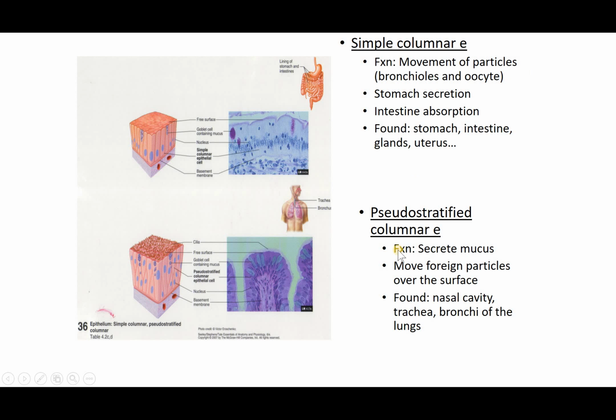Okay, and this next one, pseudostratified columnar epithelium. So pseudo means false, stratified columnar. So if you look over here, it does have kind of a false multi-layered column look to it. So that's where the name comes from. Now we're going to add to this ciliated, ciliated pseudostratified columnar epithelium, because there's your cilia, the hair-like projections found within this tissue.